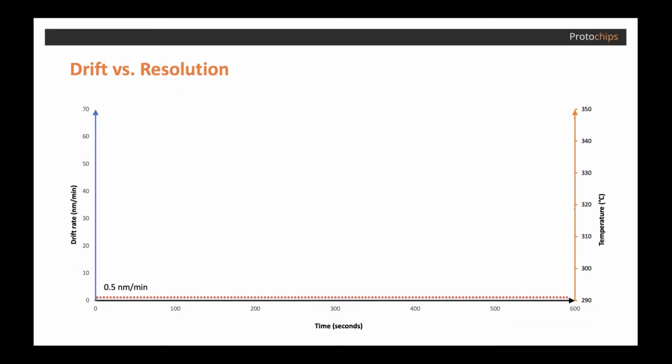So, as mentioned on the last slide, the explosion in situ TEM brought new sources of drift to be dealt with. The reactions that are triggered can lead to very fast dynamics. And you've got particles traveling on a substrate, joule heating caused by high current during electrical failure tests, rapid growth of large structures at high magnification. And all these make the situation much more challenging. In certain applications and situations, these conditions may completely eliminate the ability to reach high resolutions and will rob you of enjoying the full capabilities of your TEM.